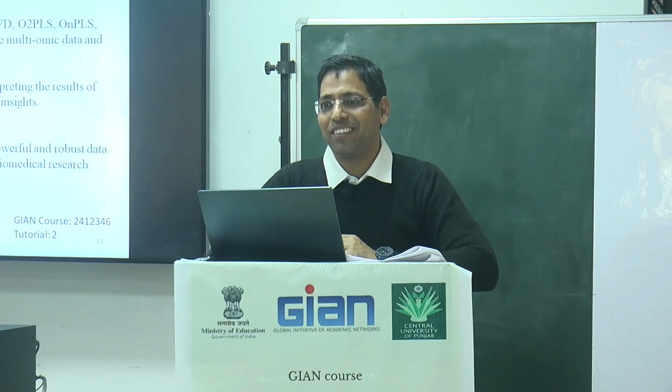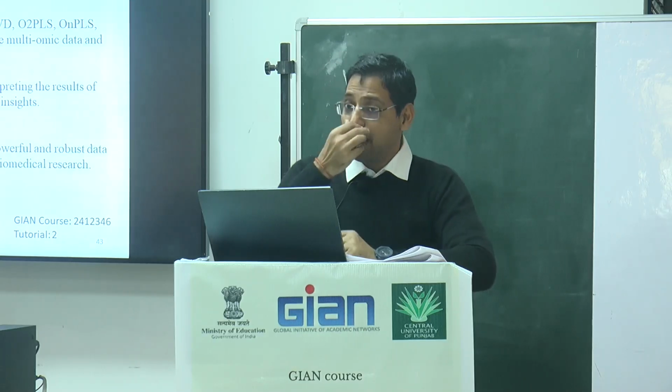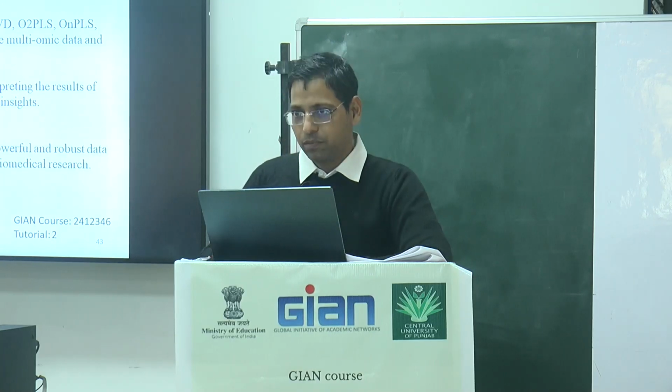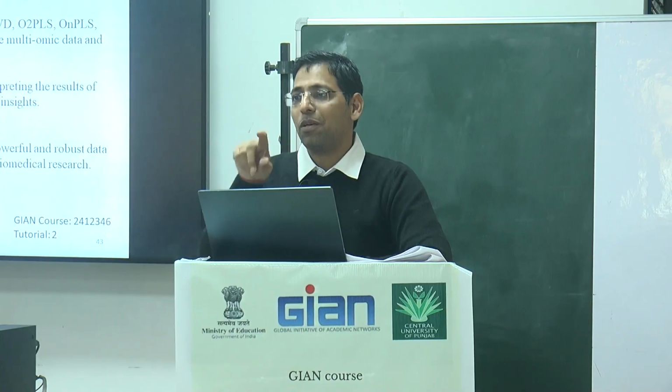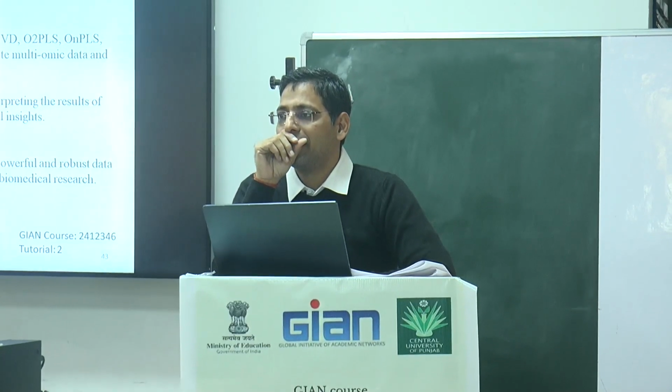Actually, ma'am discussed with me. I told her that there might be some other derivatives that come up. And remember one more thing: we are identifying these compounds with the library, so the library may be giving false results. What she is saying now is that with the same sample, the same graph, she is getting the compound in 3 different articles.